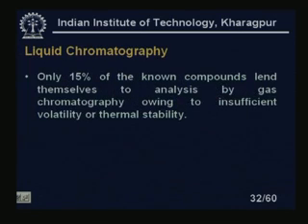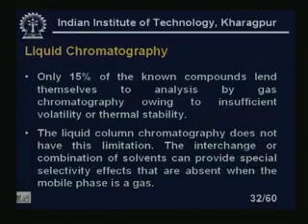Liquid chromatography. Let us know that only 15% of the known compounds lend themselves to analysis by gas chromatography, owing to insufficient volatility or thermal stability. This is the most important: the sample should not vaporize every time, as we have said. Liquid column chromatography does not have this limitation. The interchange or combination of solvents can provide special selectivity effects that are absent when the mobile phase is a gas.